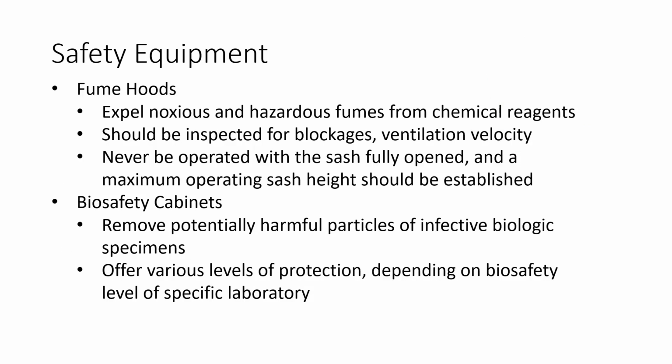Some safety equipment in the laboratory. Fume hoods expel noxious and hazardous fumes from chemical reagents. They should be inspected for blockages and ventilation velocity, and they should never be operated with the sash fully open, and a maximum operating sash height should be established.